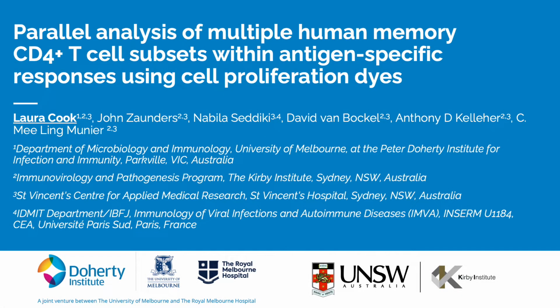In the next few minutes, I'm going to talk to you about the assay we developed to track several human memory CD4 T cell subsets within antigen-driven responses.